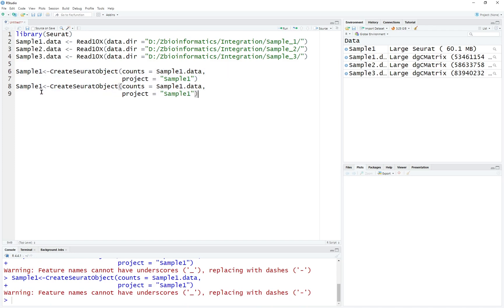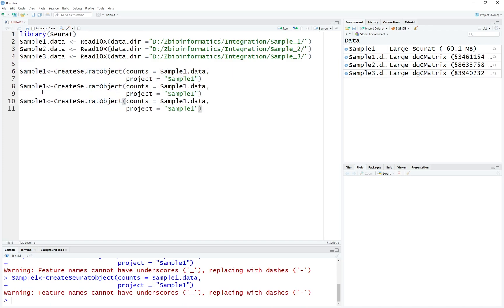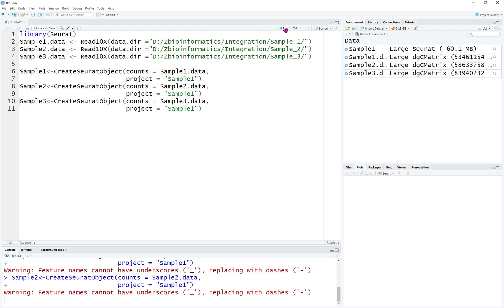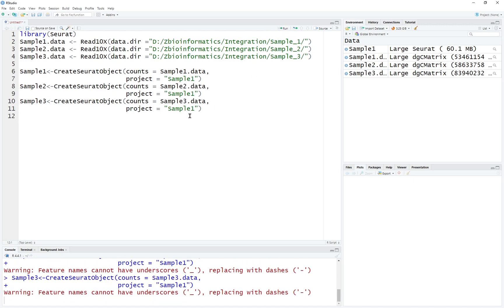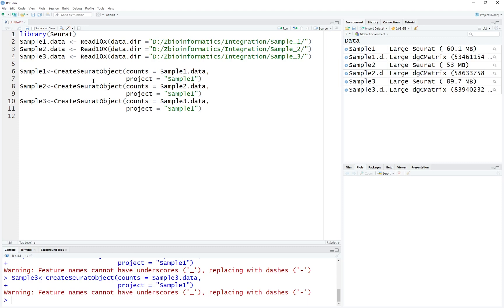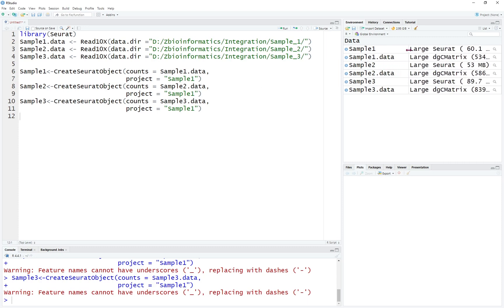Let's copy and paste it for sample 2 and sample 3. We're going to run these other two lines. This will create three Seurat objects. We can see them in the environment — this is the Seurat object and this is the raw data we loaded.